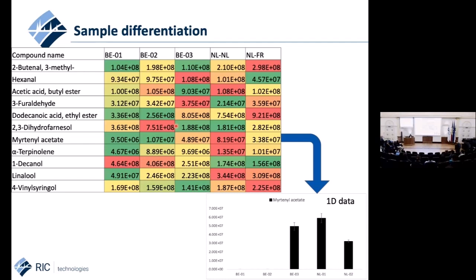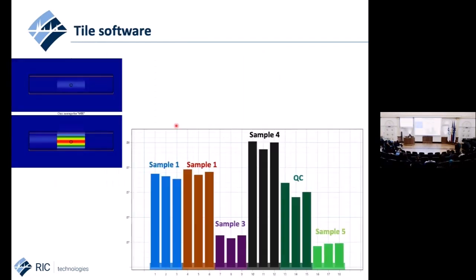And these data have been reconfirmed with the GC times GC data, indicating that the markers previously suggested are still valid, but probably with the new data we will be able to find newer, more selective, better markers for the different beers.